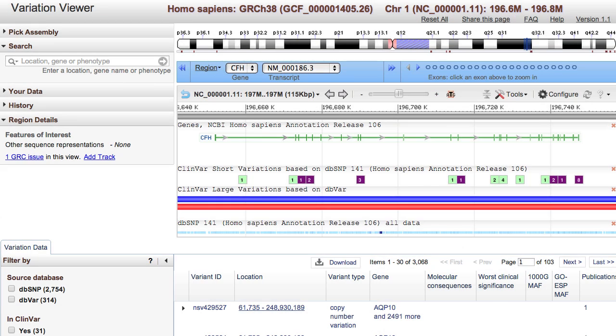The Variation Viewer allows you to view, search, and navigate variations present in dbSNP, dbVar, and ClinVar in a genomic context.